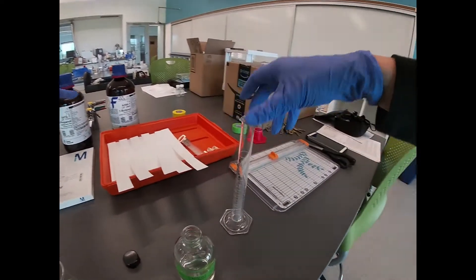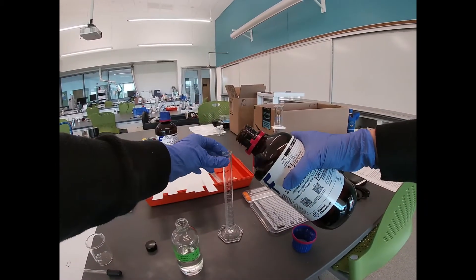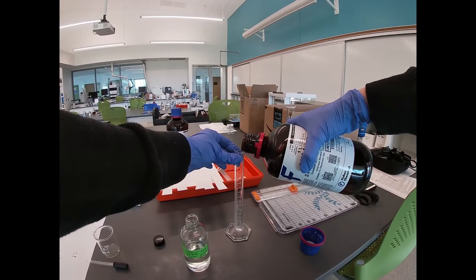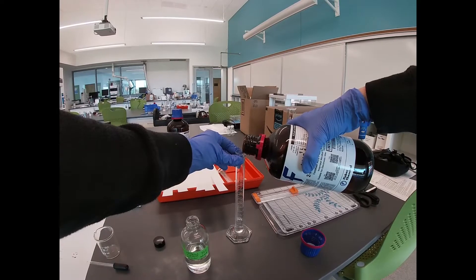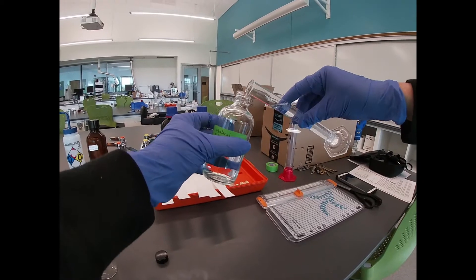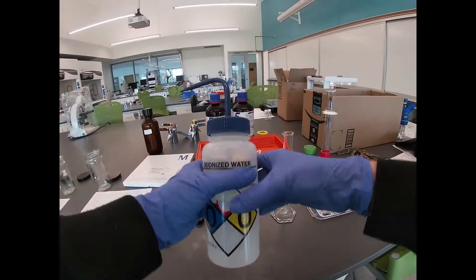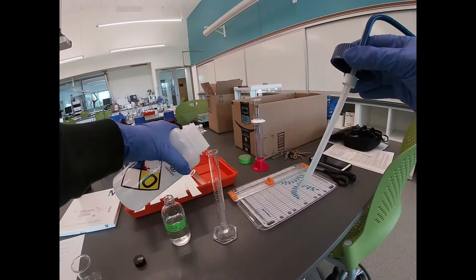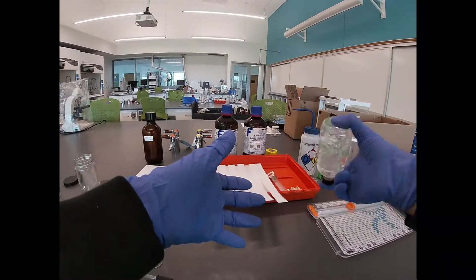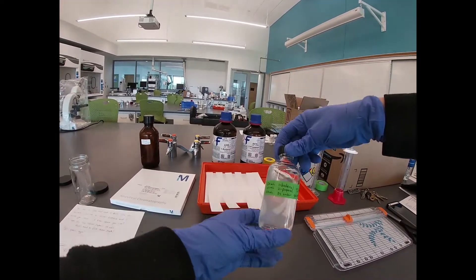Then we've got 2-propanol, which is also known as isopropanol. Our 2-propanol has three carbons and the hydroxyl group is in the center on the second carbon — 25 milliliters of this. It's a little more polar than the 1-butanol. And then 25 milliliters of deionized water. Make sure that this is well mixed. So we have our TLC solvent prepared.